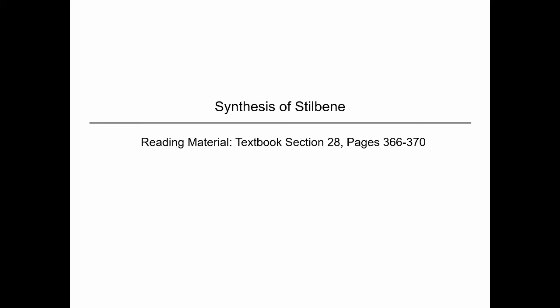Welcome back, everyone. So this is going to be the lecture for the second experiment for the OChem lab. It is the synthesis of Stilbene. So you can follow along with me on your textbooks, section 28, pages 366 to 370.